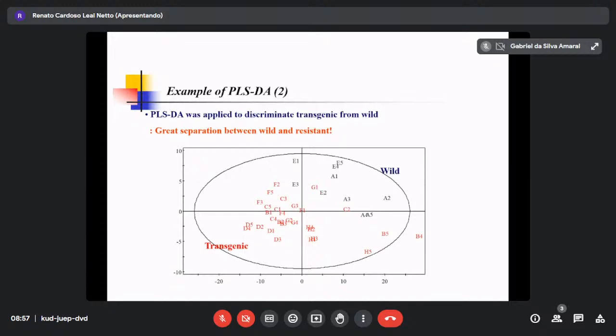Now you measured NMR or LCMS, you did metabolomic cases. Now all the species are located inside of this Hotelling test, but only one species is outside, then it's a starting point of discussion. This species, you can say, is a very exceptional case compared to other species.